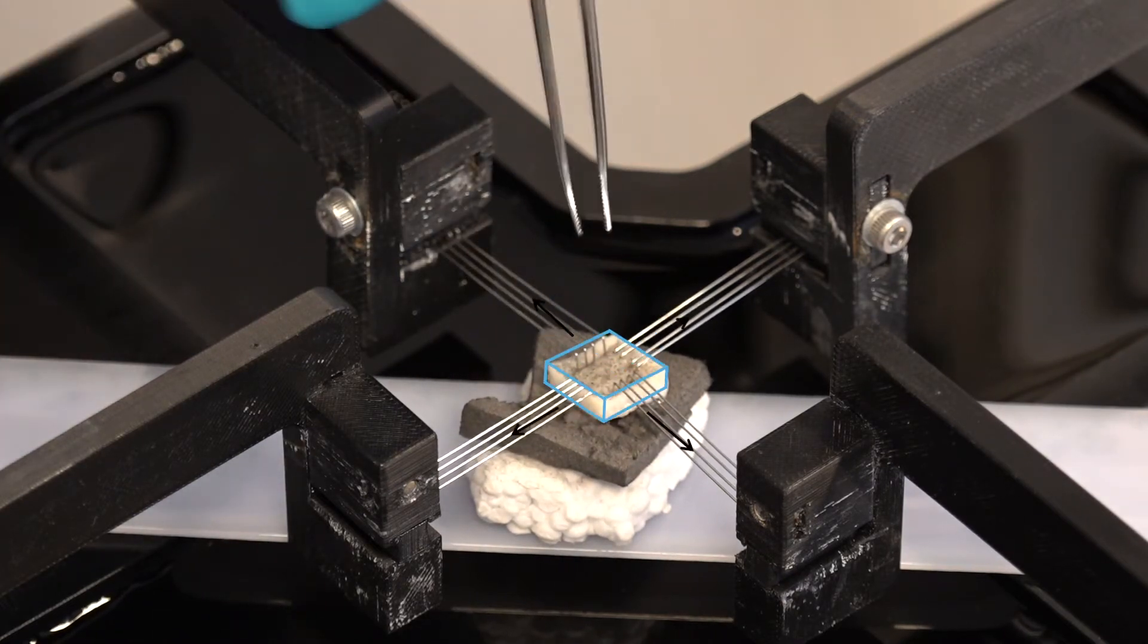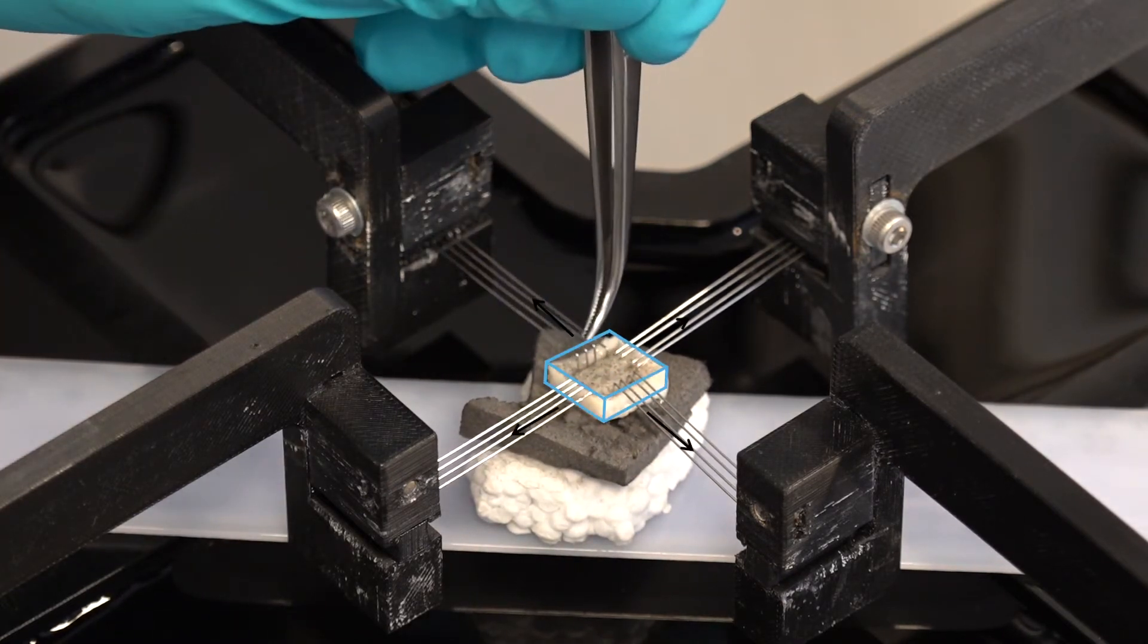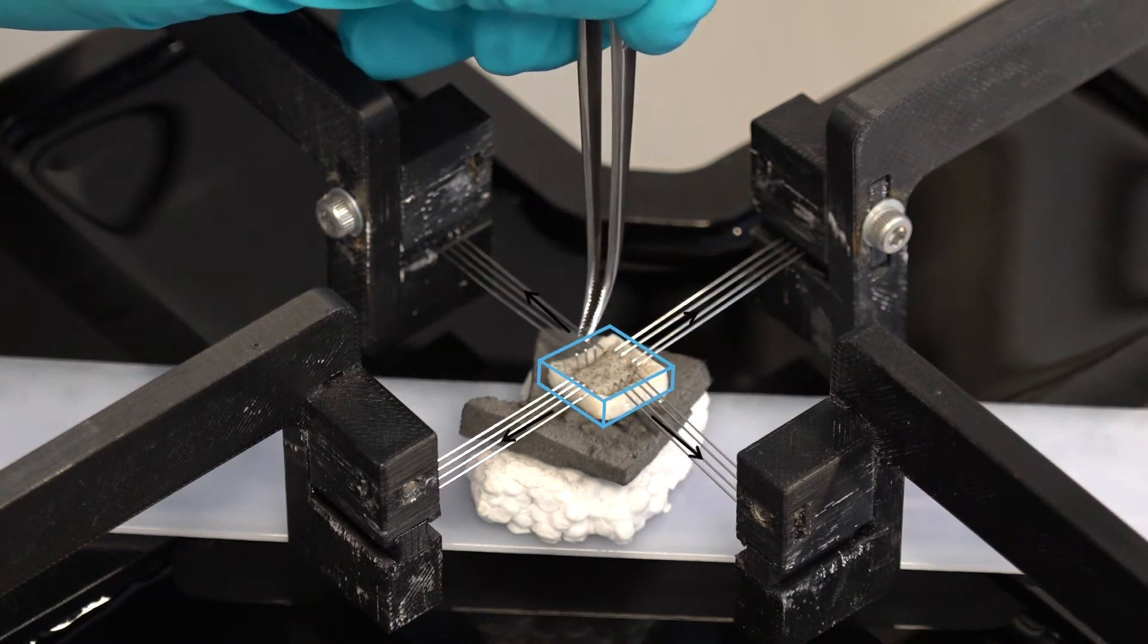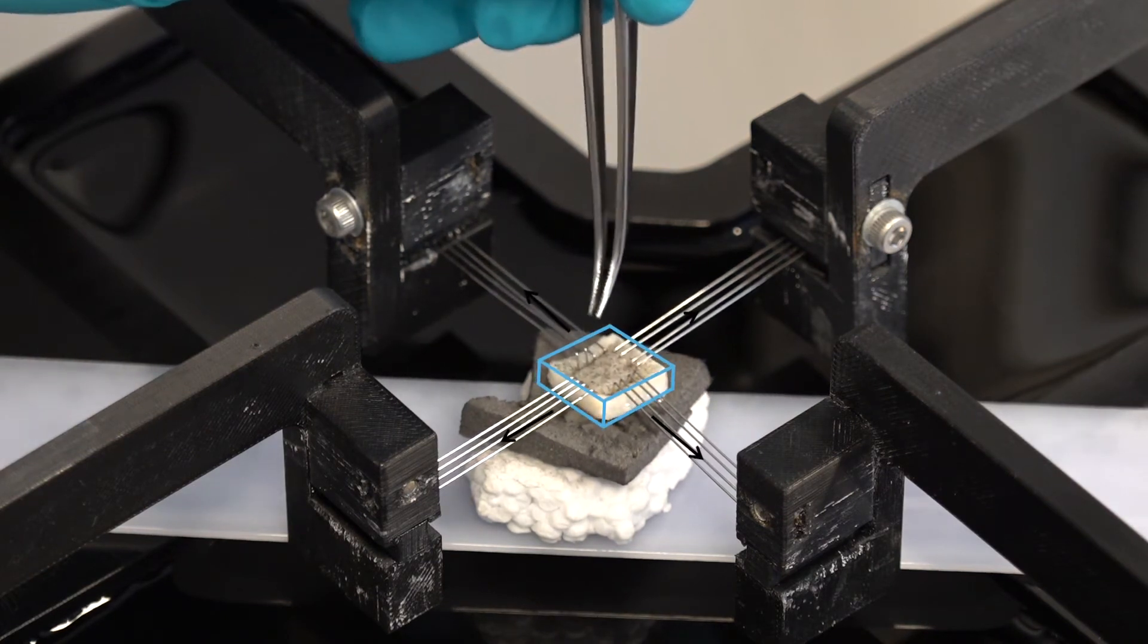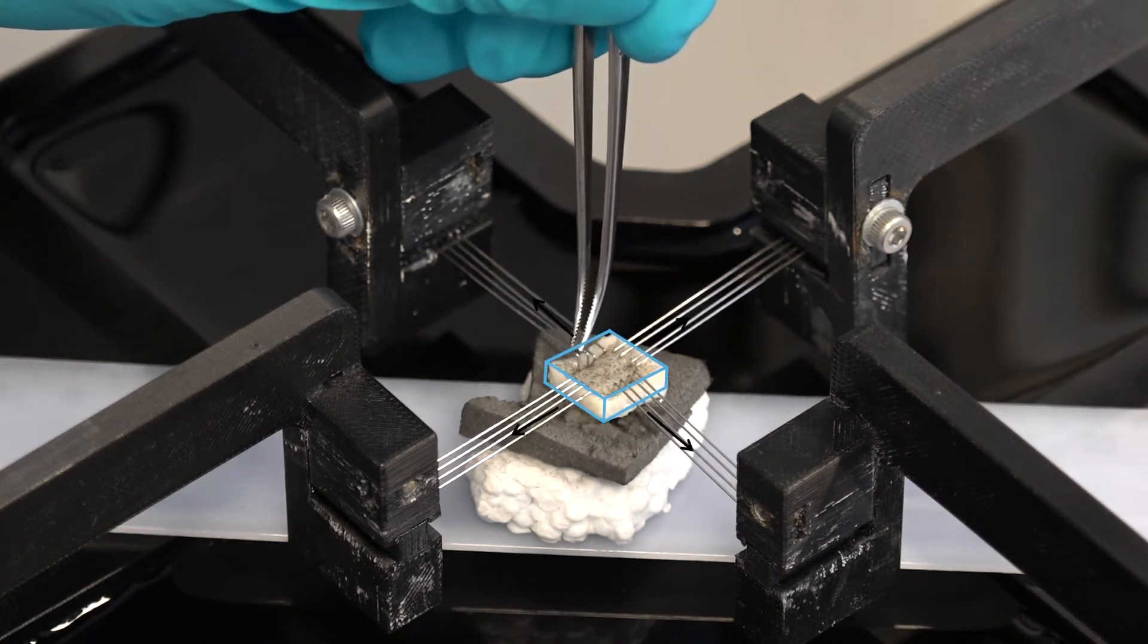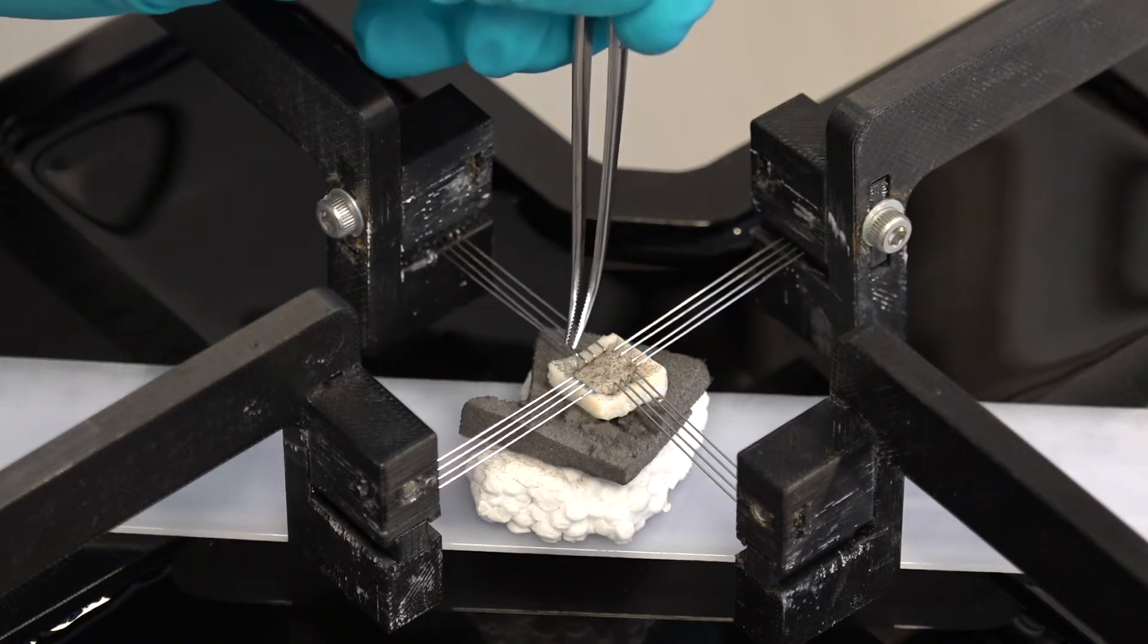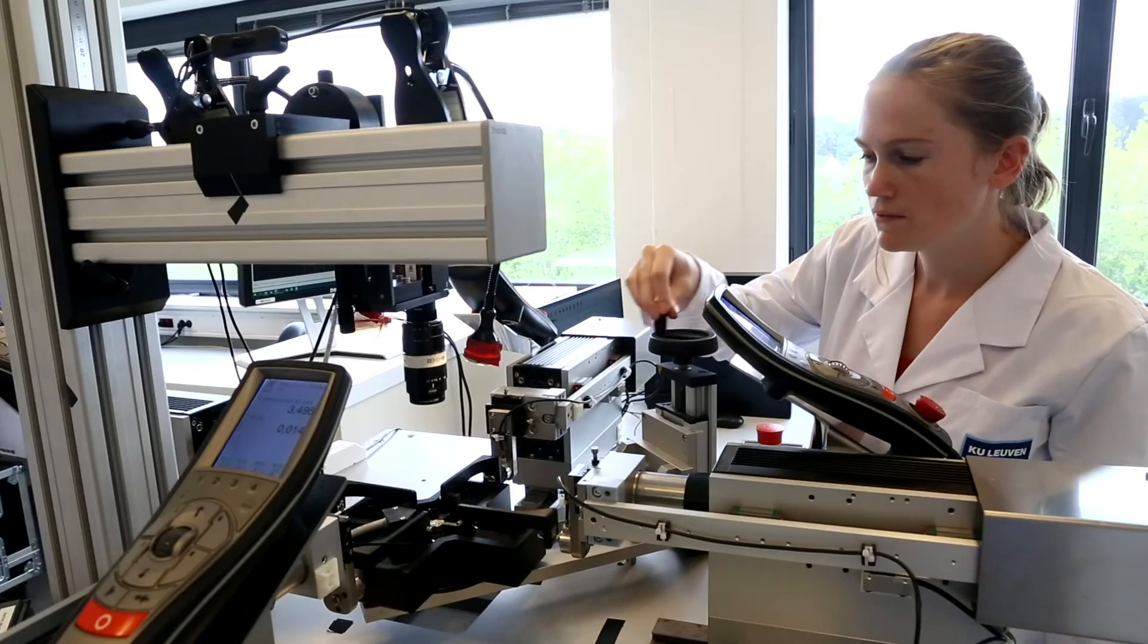Here, we've used a rake-based system, in which the samples are pierced with needle-tip hooks or rakes, with sets of five rakes on each edge of the sample.